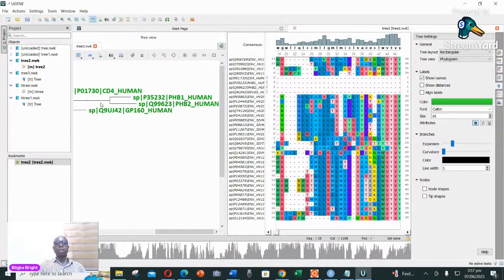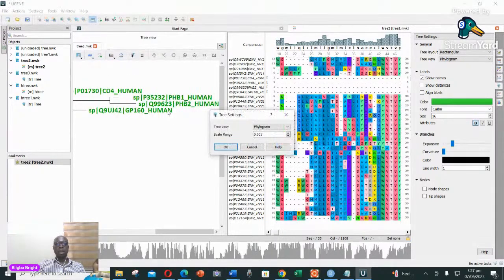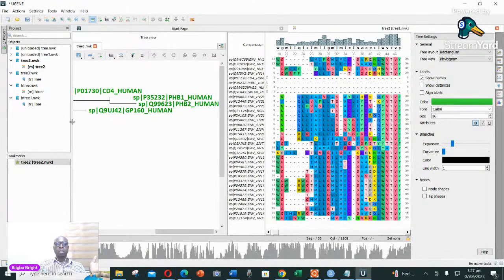You could have done this with any sequences, either DNA or RNA or whatsoever. It depends on your sequences, but the approach is the same, and that's what I wanted us to pay attention to. So I just come here.